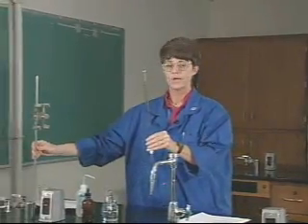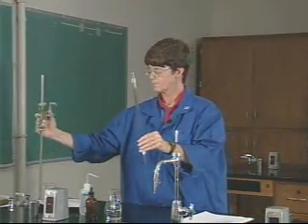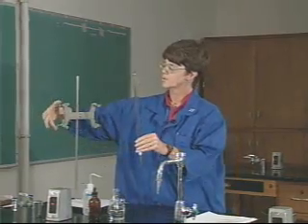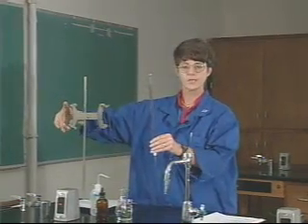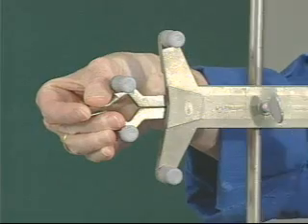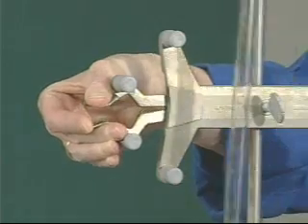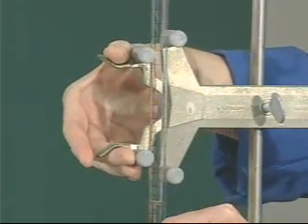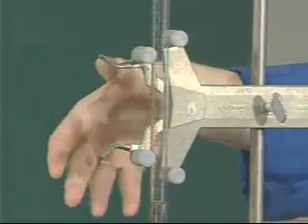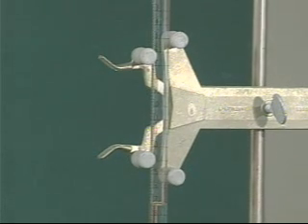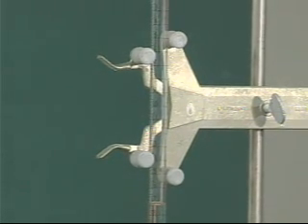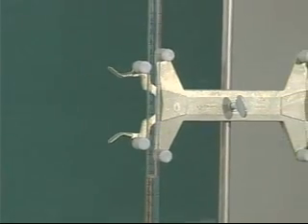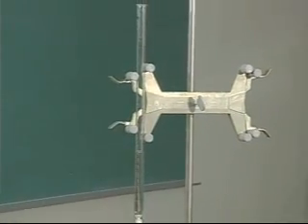The burette clamp is new to you, but not difficult to use. You simply squeeze together these two pieces and that brings the holders apart. You can then put the tube of the burette there and gently let those two parts go, and the burette will be securely clamped for use in the experiment.